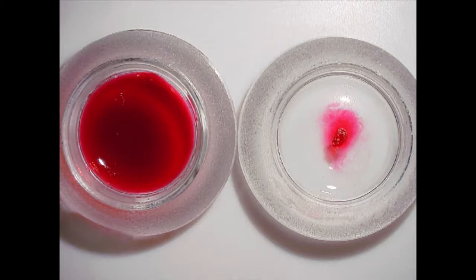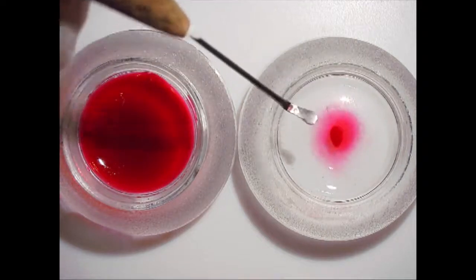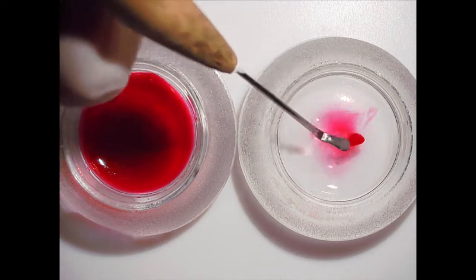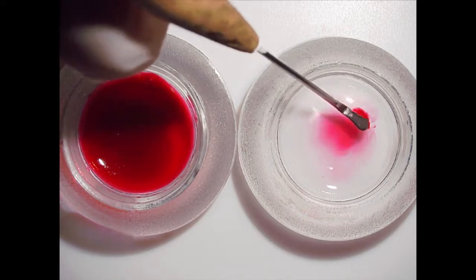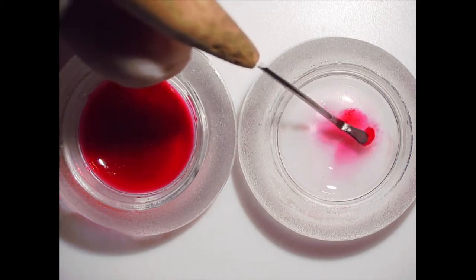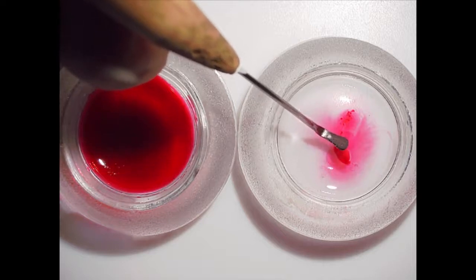Now the specimen will be filled with a staining solution inside, so you will have to move the specimen around. This is actually not only dehydrating the specimen, but you're also destaining it slightly. The integument will still be stained, however. It also gives you a chance at this time, since sometimes there are still some internal contents, to do a little bit of removing of the insides of the scale. You'll see the stain out to the side.